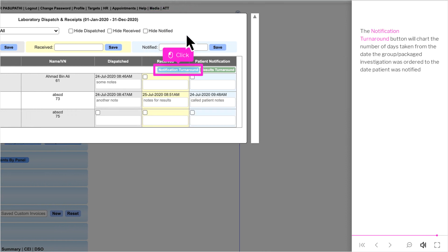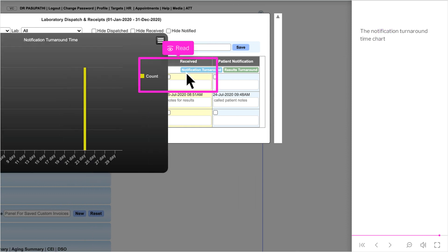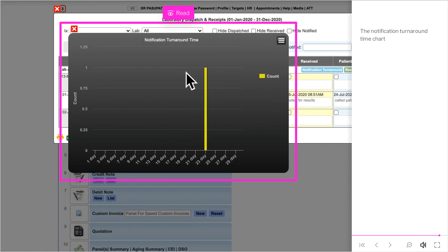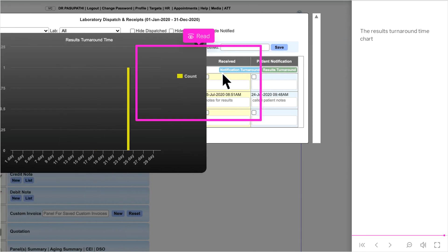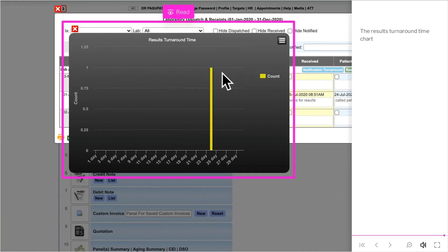The Notification Turnaround button charts the number of days taken from the date the group or packaged investigation was ordered to the date the patient was notified. The Results Turnaround button charts the number of days from the order date to the date results were received.